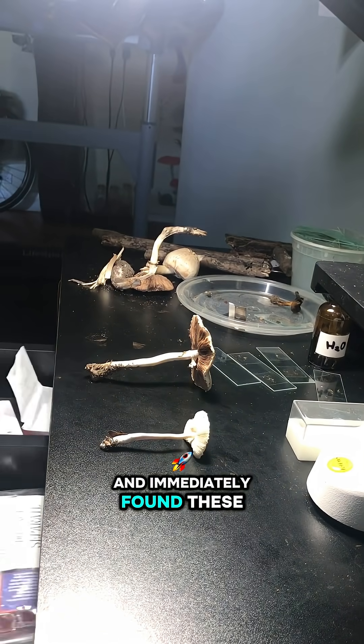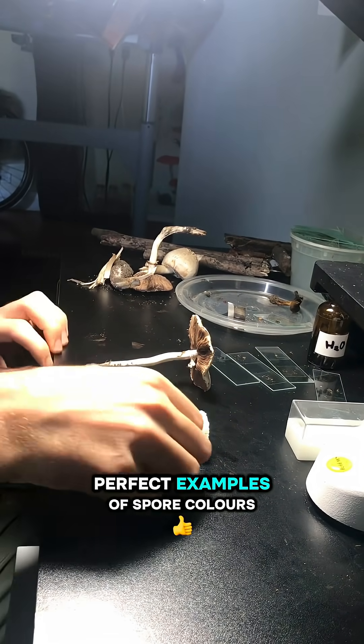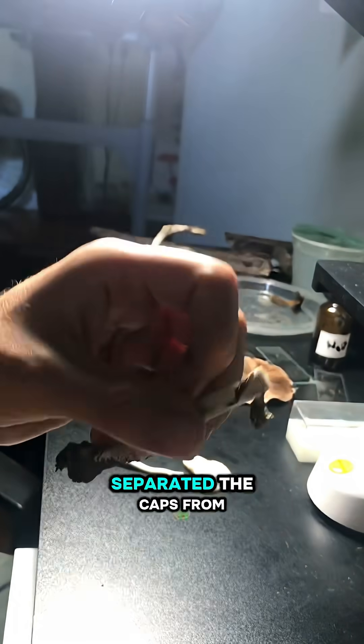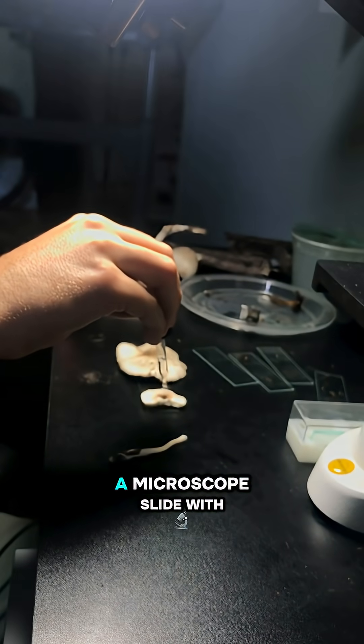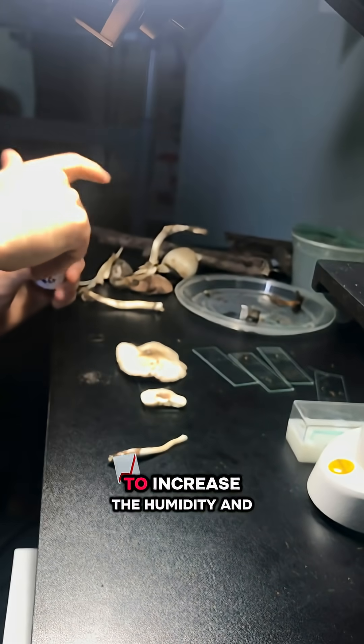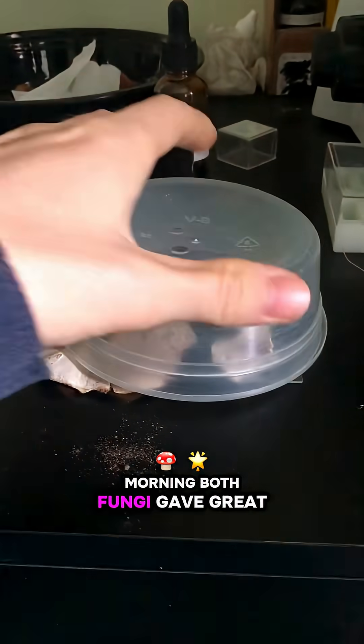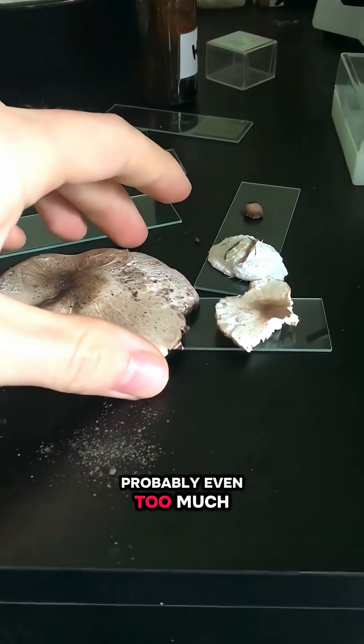I walked outside today and immediately found these two mushrooms and thought they were perfect examples of spore colors and how you can use it with a microscope. First things first, I separated the caps from the stems and placed them on a microscope slide with some water on them to increase the humidity and covered them. I let them sit overnight and the next morning, both fungi gave great spore prints, probably even too much.